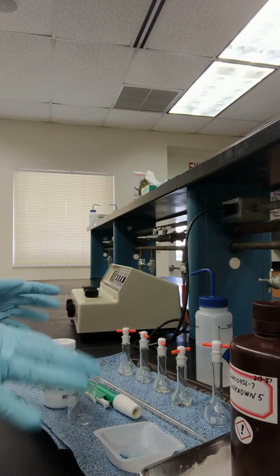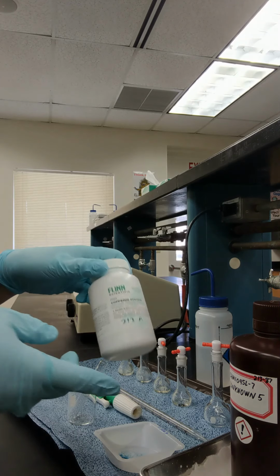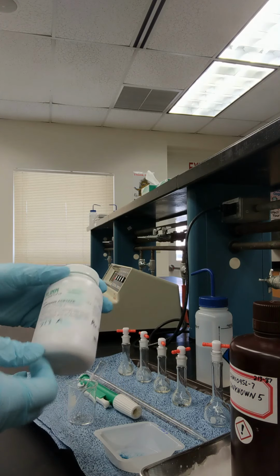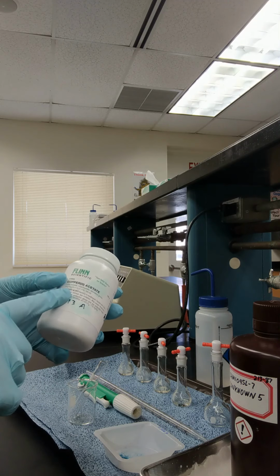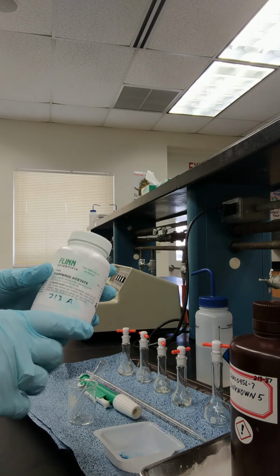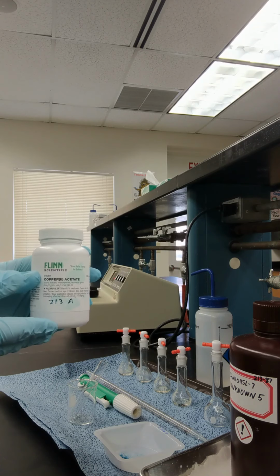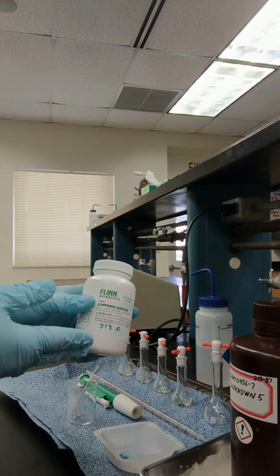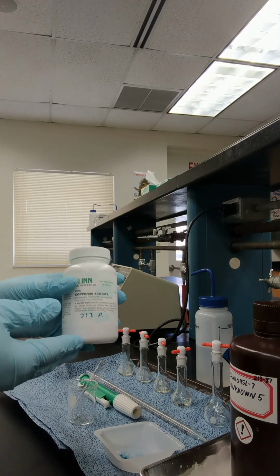So I have here everything that we need for this experiment, which is determining the concentration of copper in solution. We're going to be using copper acetate to prepare our stock solution. We have to calculate first how much of this compound, copper acetate, we need to prepare a solution with a concentration of 0.1 molar and a total volume of 25 milliliters.